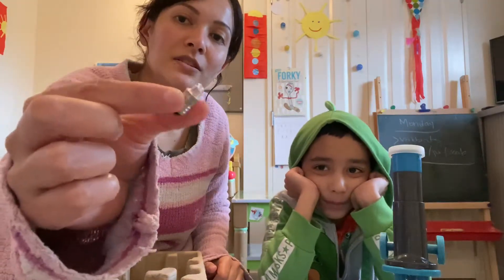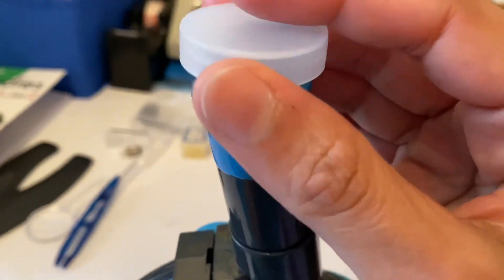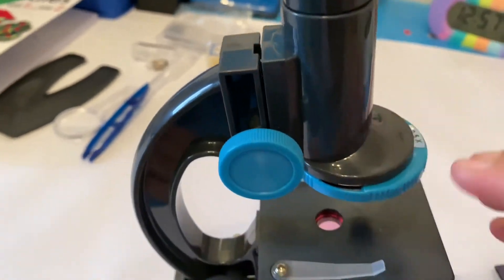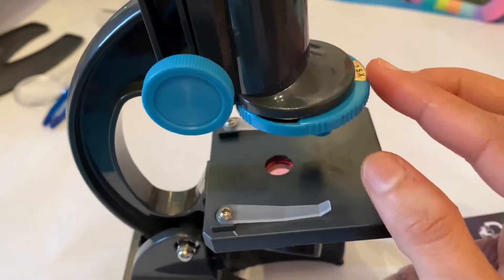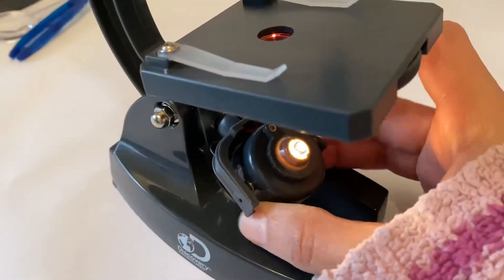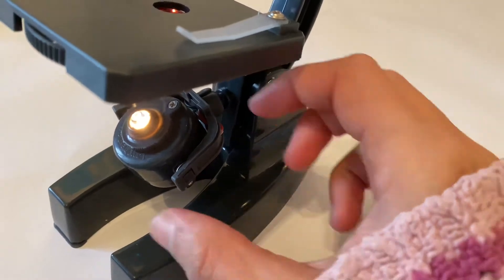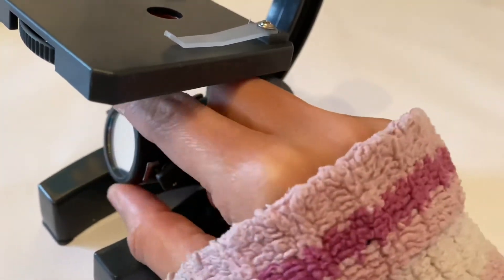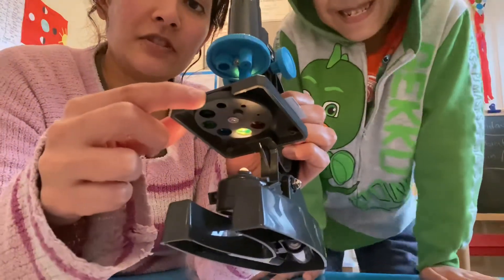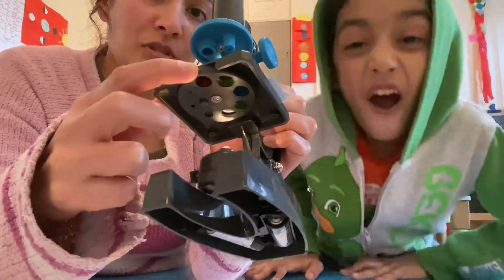Here's the microscope itself — that's the eyepiece, that's the body tube, these are the knobs, the lenses, and that's where the slides go. The battery case is down here, and we have a mirror just underneath. Down here you have the revolving colored filters, which change the colors so you can see any specimen using these as well.